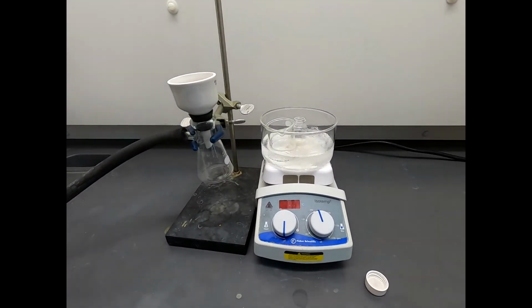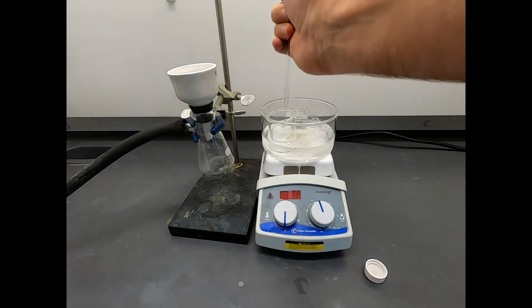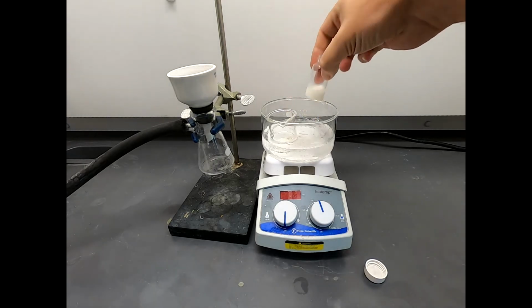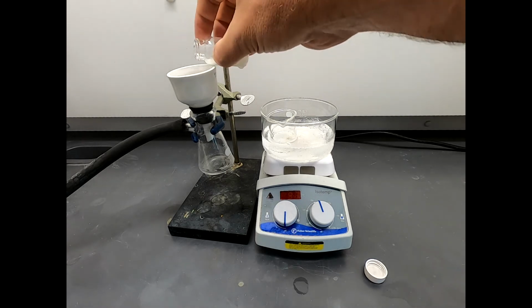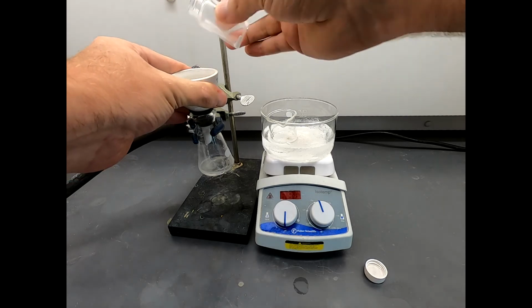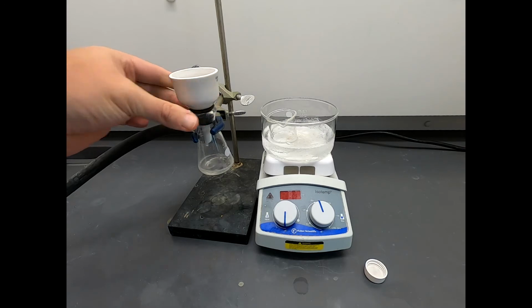So with that, I'm going to turn on our house vac, and let's seat the paper. We're going to seat the paper with the same solution that we're using for the rinse. It's approximately the same that's in this little vial. And I'm going to swirl this around. I do have a stir bar in here. I'm not going to worry about the stir bar. If it falls in, I can get that back out later. I don't think it did fall in. No, it didn't. Okay, so you hold down the funnel. Make sure you have a good seal.